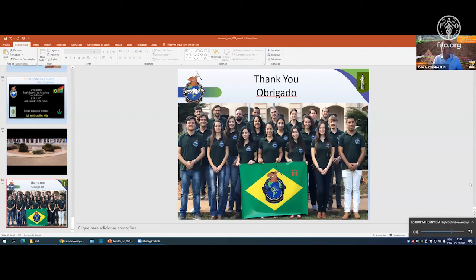Yes, a very good question, because just now, Dr. Ayo Bendar will say that there is a group working in the world to, one, create protocols and rules for spectroscopy, and two, to get an ISO reference for the use of spectroscopy for soils. So the sensor will have to have this ISO for soil analysis, and this is ongoing and probably will end next year. So these things that you're asking for are already being prepared. The idea is that at the end, you will have all the protocols, like a wet laboratory: the method, the rules, an ISO, the regulations, all said, and the types of sensors that you have to use and all this stuff.